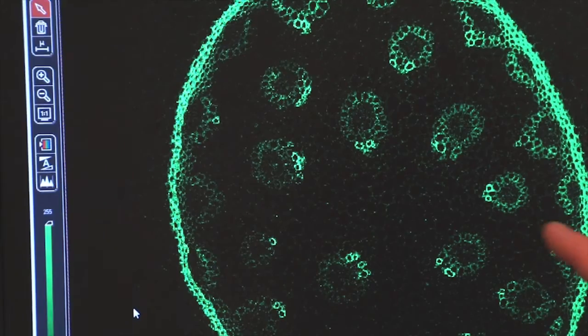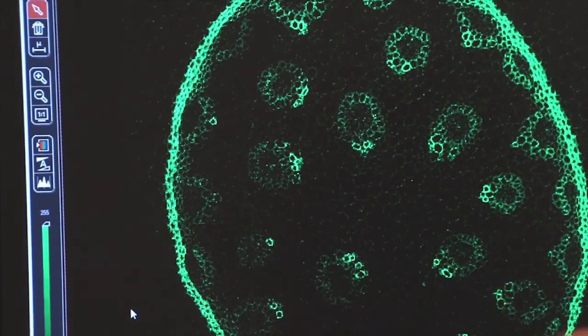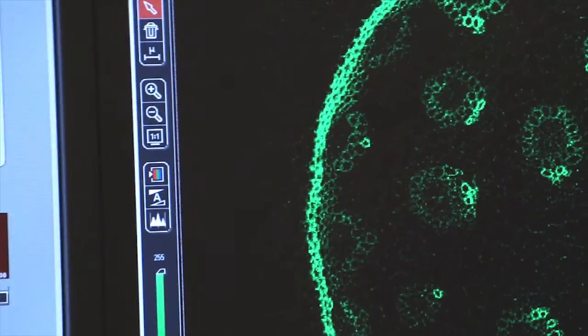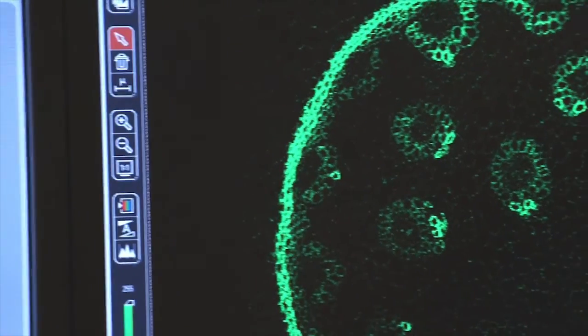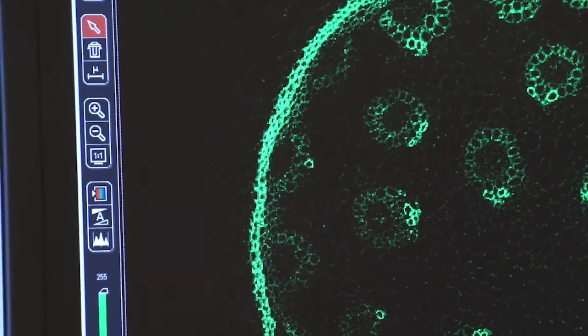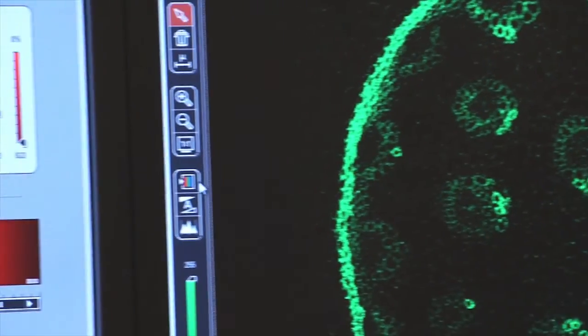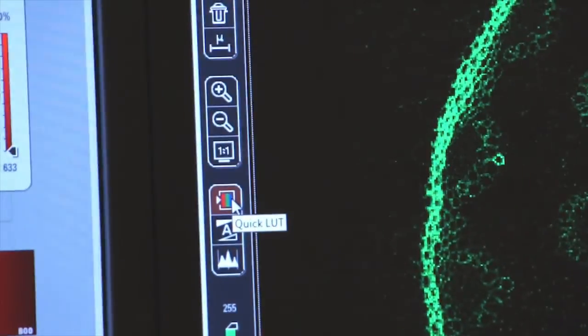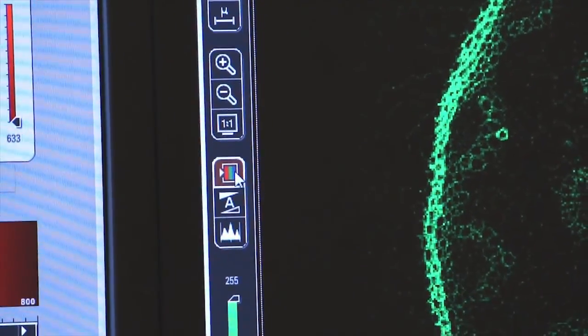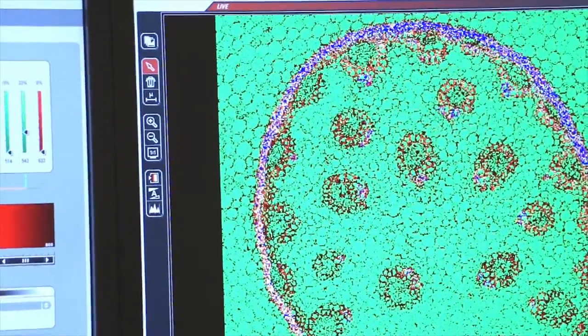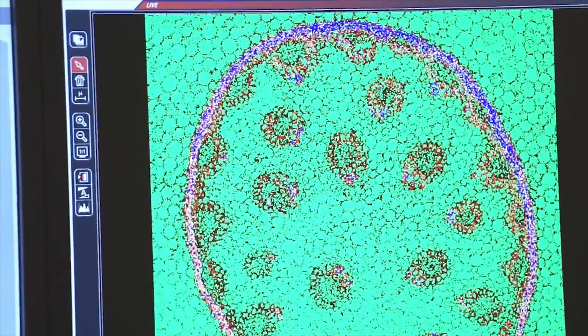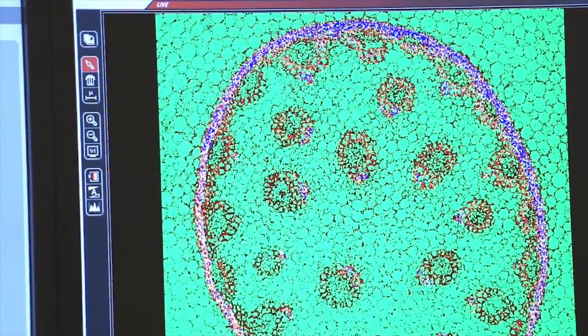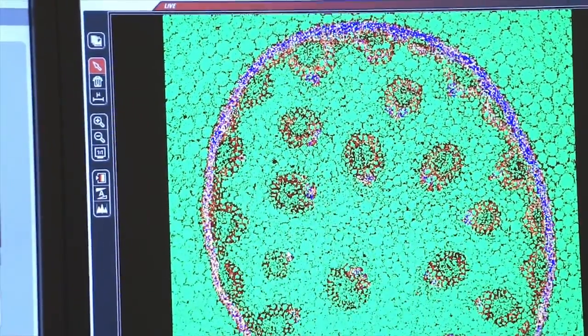We now have a live image on the screen and I want to show you an easy way to set the gain and the offset so that your images are the crispest they can be. If you click on this little box here, this is the quick lookup table. You click on it once, it changes the color of your pixels to blues and greens that you can use to identify how your gain and offset should be set.